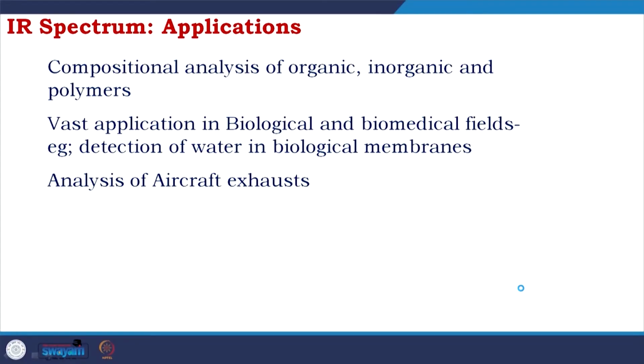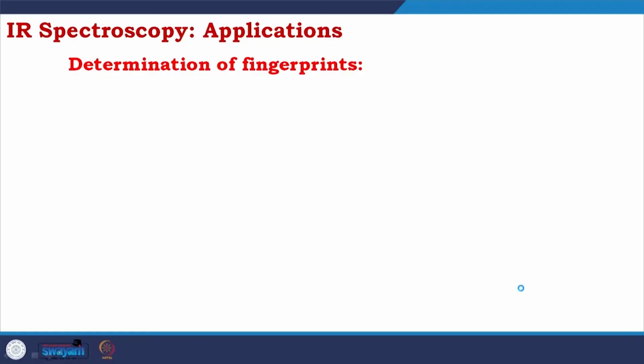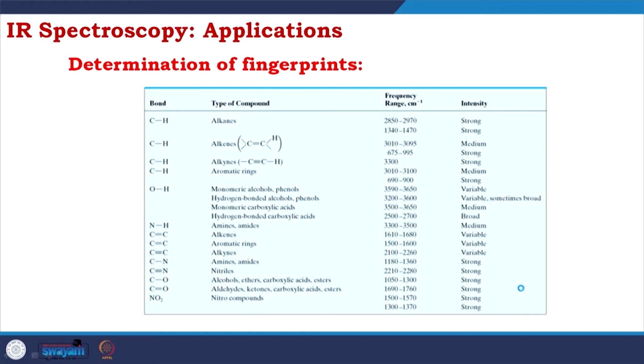Analysis of aircraft exhausts, measurement of toxic gas in fuels, combustion, gas analysis, all could be done with very good precision using infrared spectrum. So, application: determination of fingerprints.